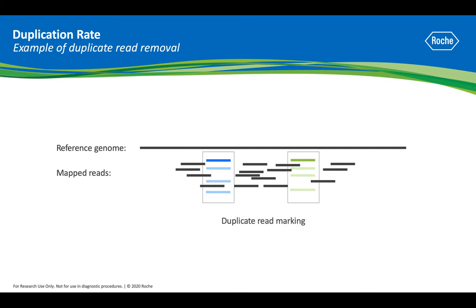To eliminate artificial overrepresentation of these sequences, these reads should be filtered from the sequencing data, otherwise they can lead to biased and inaccurate SNP calling, variant calling, and assessment of genome coverage.